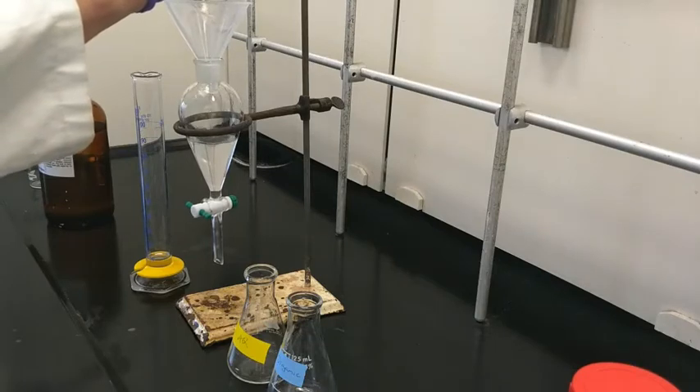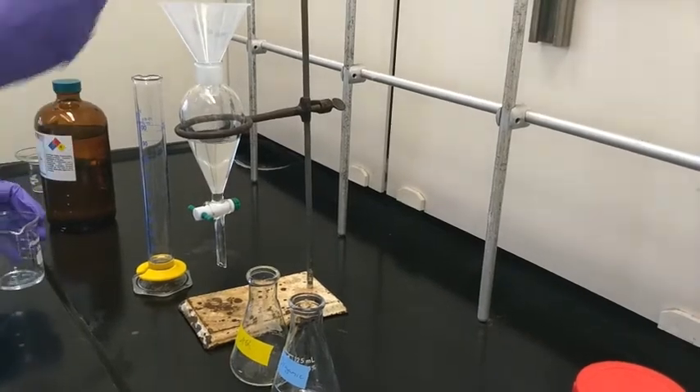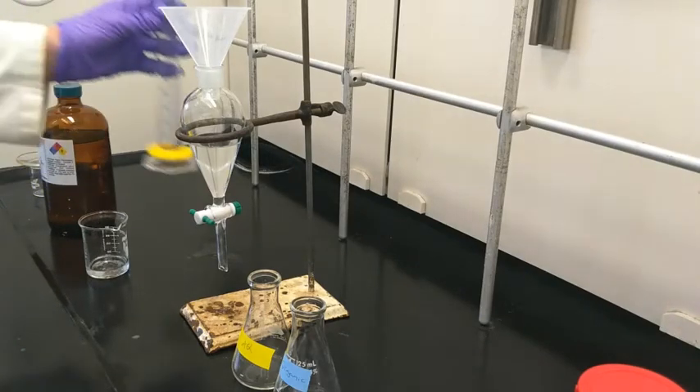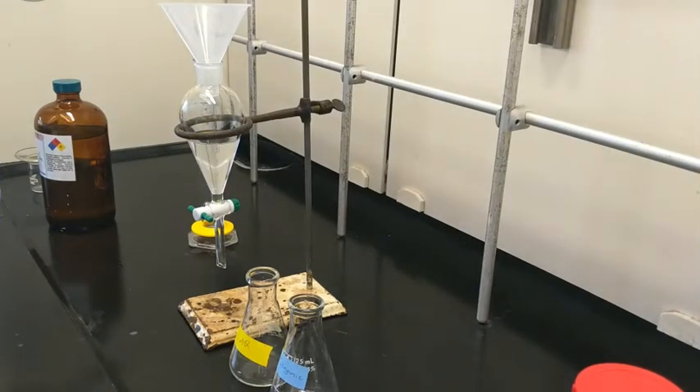The sample didn't all dissolve, so I'll need to wash it a second time with some additional solvent. Take care not to add solid directly — always dissolve in another container and just add the solution to the sep funnel. If you have solid in there and it clogs that little valve opening, it's a real mess and a pain to clean.